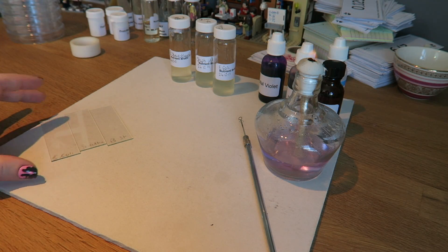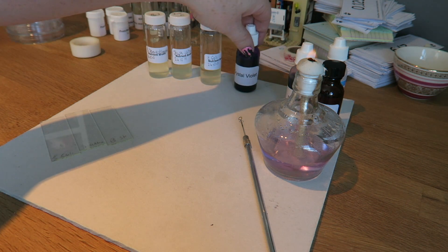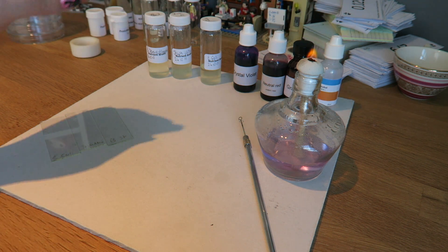First thing we need to do is make sure we've got everything ready. So I've got my slides labelled, my cultures, my crystal violet, my neutral red, my Gram's iodine, and my absolute alcohol.